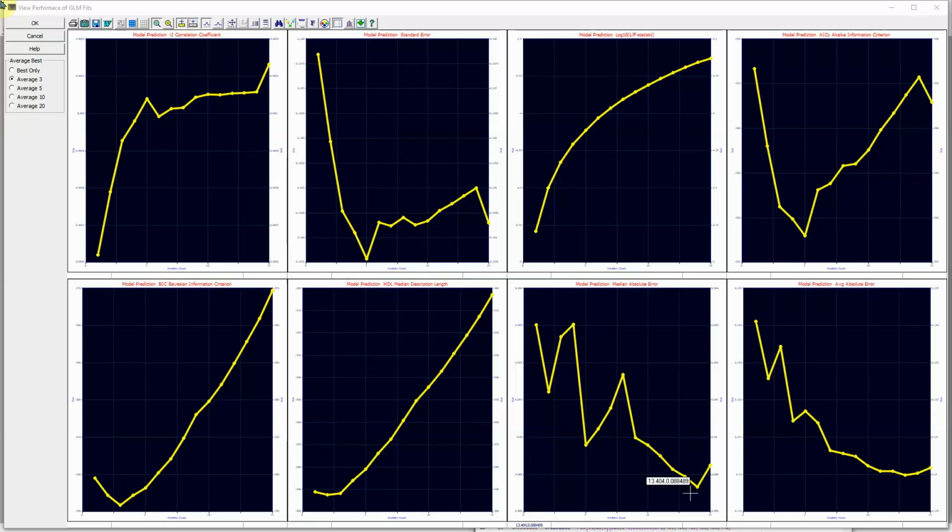The F statistic is conservative, suggesting 1 predictor. The corrected Akaike is a bit liberal in suggesting 5. The BIC and the MDL at 3 and 2 are midway. We often use the BIC or MDL in our modeling. The MDL will be a little more conservative since it incorporates the F statistic.